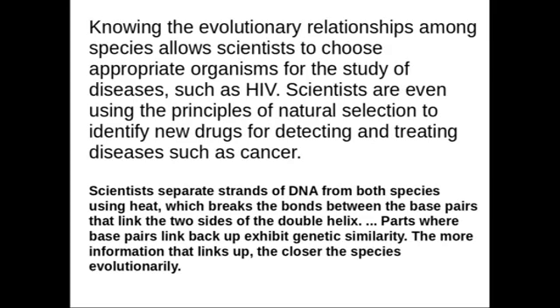Or maybe you want to try it on mouse. You understand? So, different organisms. So you can actually use evolutionary relationships when it comes to building a tree to understand those organisms that are closely related to man. You understand, that share common ancestors. You understand what I'm saying?